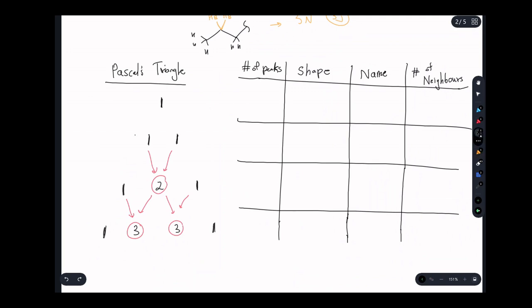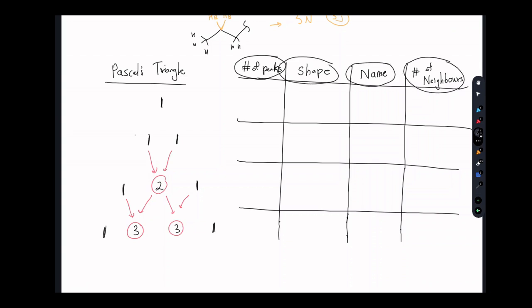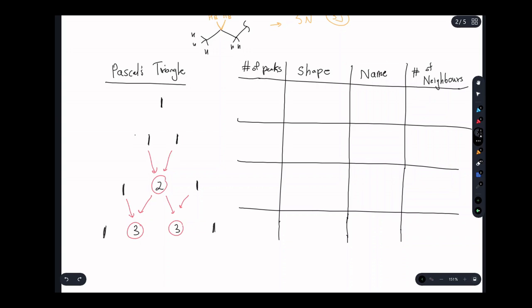So interestingly, as we're going to have here, this is the number of peaks of the signal. I'll draw the shape of the signal. We'll give it a name, and we'll figure out the type of information we get. So one peak of one height, we can start with the lowest number of peaks that's possible, right? 1 peak. If you have an NMR signal with 0 peaks, you just simply don't have an NMR signal.